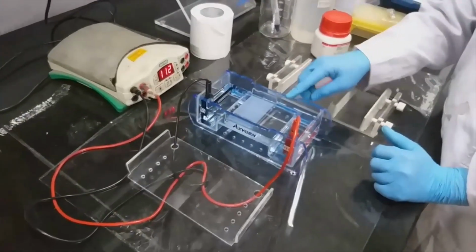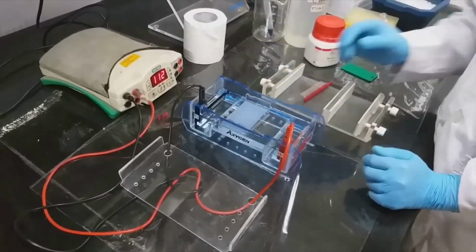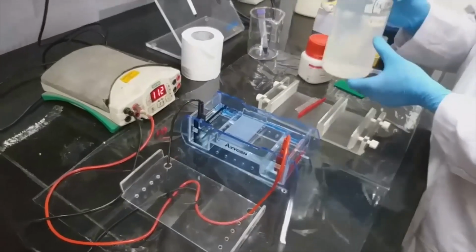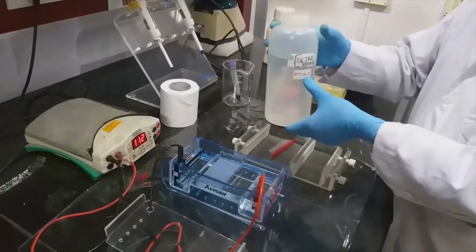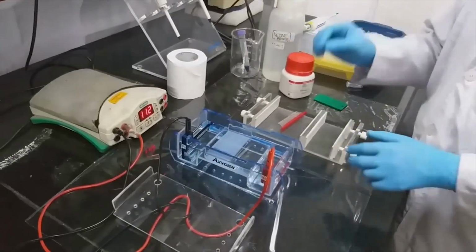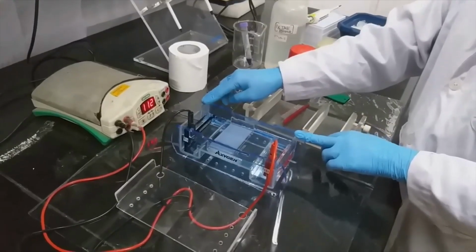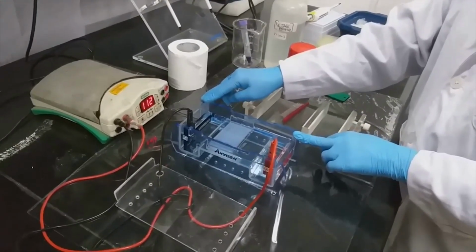Make sure that the buffer submerges the gel. We have to fill the remaining part with 1x TAE buffer. Generally, for analyzing DNA samples, we will use agarose gel electrophoresis.